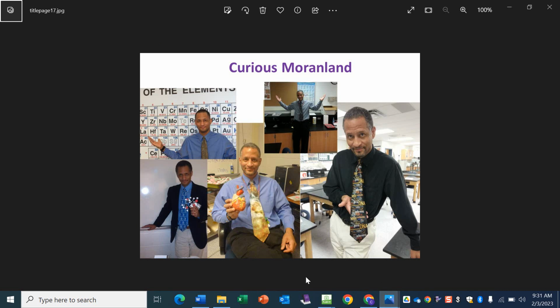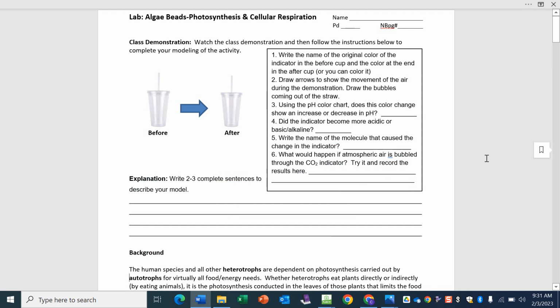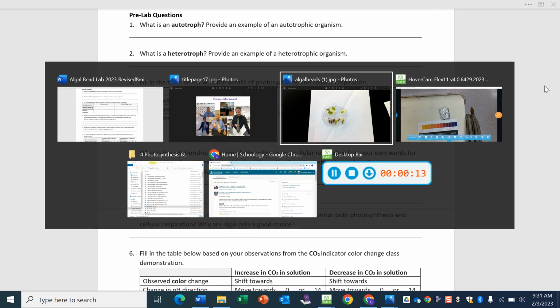So this is the algal beads lab. I did a video on how to do it, so here's where we are now. I want to show you the lab setup and some results.